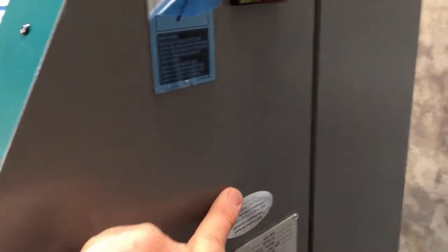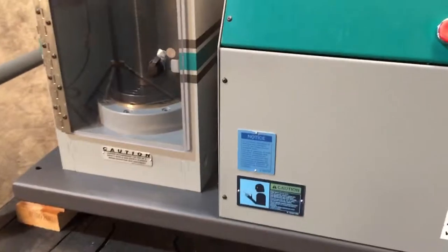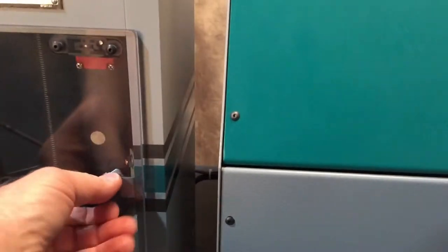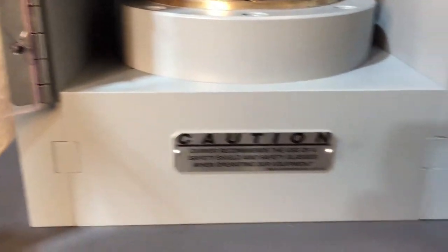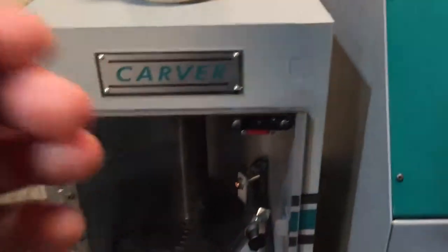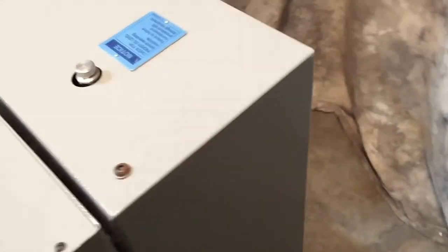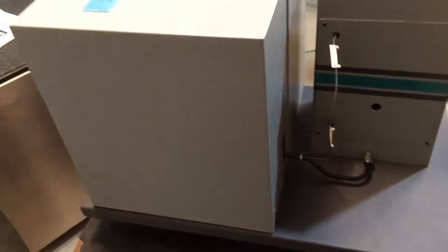It's incredibly clean and all the skin is there. There is some writing you can just barely see over here, just smudges. You can see the light — paint's in really good shape through that interlock. Look on the inside: pristine through and through. Walk around to the back — kind of the same story going on there.